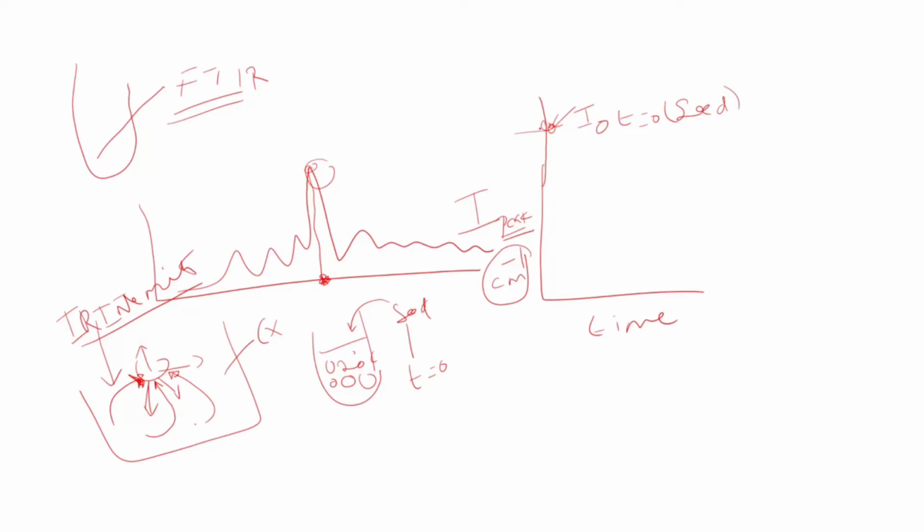Say your IR intensity is 0.35 at time t equal to 0. That's the rule: your IR intensity and the concentration of your paracetamol increase linearly, something like this. So if your concentration is small, your intensity will be small. If your concentration is high, your IR intensity will be high.